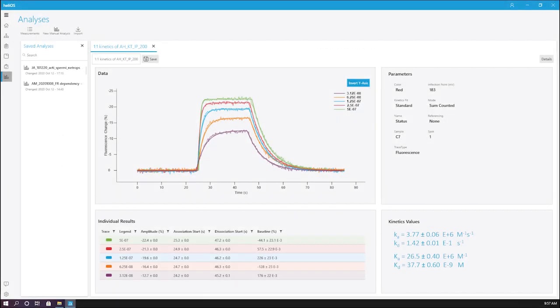Let's look at what we've measured. Here's our real-time data set as displayed in the Helios software, which already contains the most important information about our samples. We can see the five individual runs at different analyte concentrations in the data window, as well as the smooth lines of the fit curves superimposed on top of them, that the Helios software has automatically analyzed. The results of this global fit are displayed in the box over here, which lists the association rate constant, the dissociation rate constant, the affinity constant, and the dissociation constant.